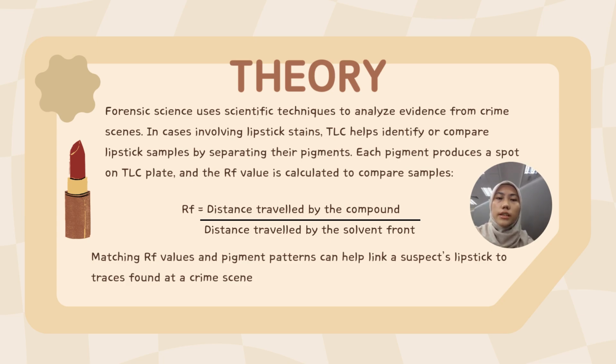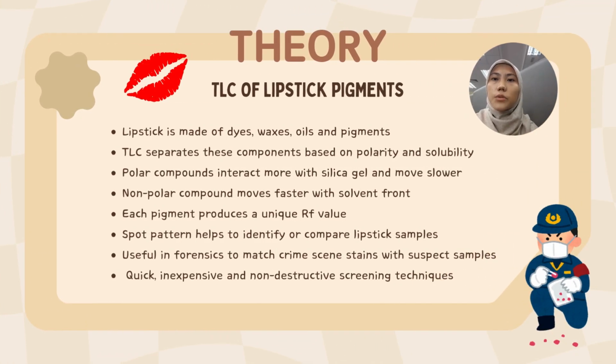Next, I will explain how scientists use thin layer chromatography, which is TLC, to study the pigment found in lipstick. As we know, lipstick is made of many ingredients such as dye, wax, oils, and color pigment. These ingredients have different chemical properties. TLC is a special method that can separate the components of a mixture based on how they behave in a solvent. It works by using a TLC plate coated with silica gel, which is a polar substance.